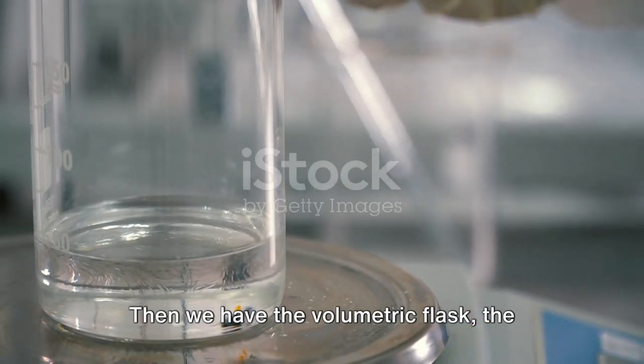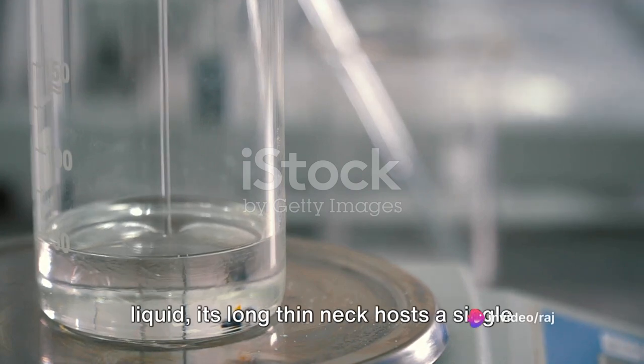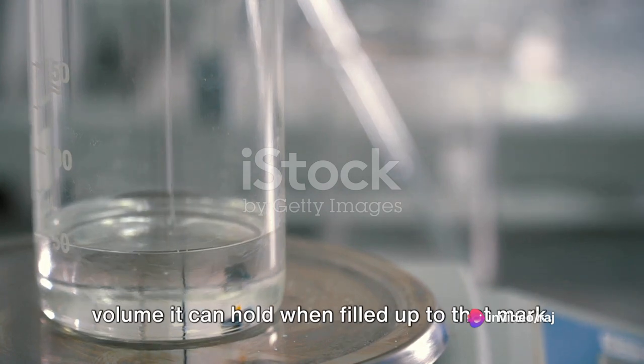Then we have the volumetric flask, the epitome of precision. Dedicated to preparing precise volumes of liquid, its long, thin neck hosts a single calibration marking, indicating the exact volume it can hold when filled up to that mark.